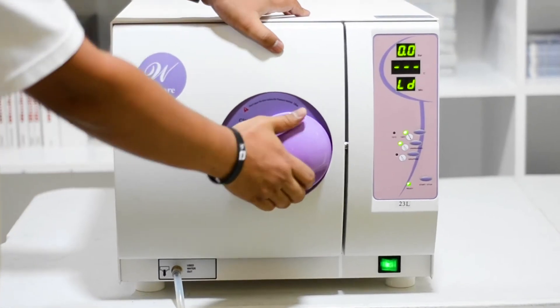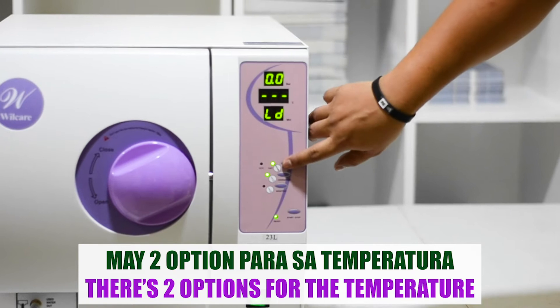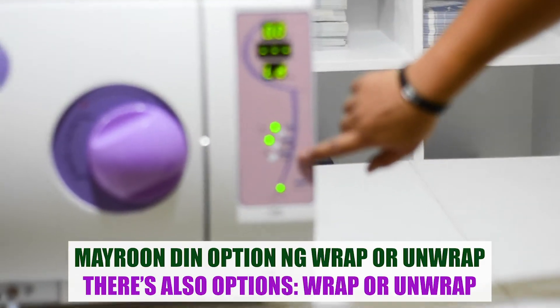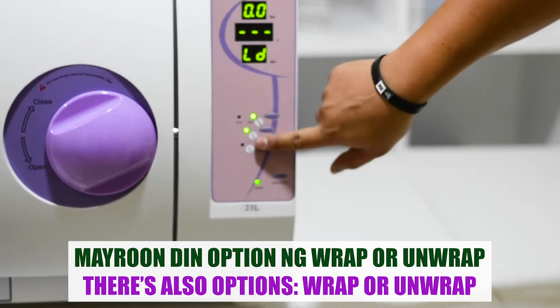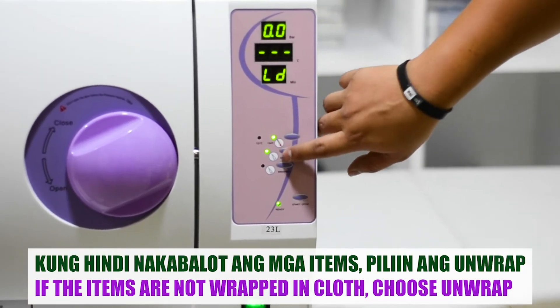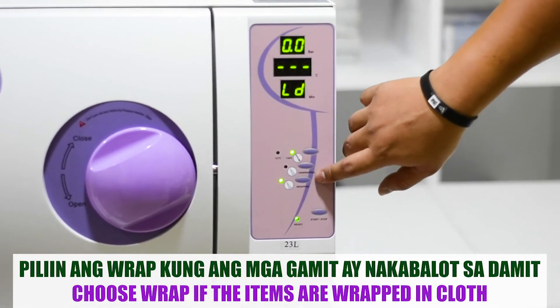There are two options for the temperature: 121 degrees Celsius or 134 degrees Celsius. There are also two other options — wrap and unwrap. Choose the unwrap option if the items are not wrapped in a cloth, and the wrap option if they are wrapped in a cloth.